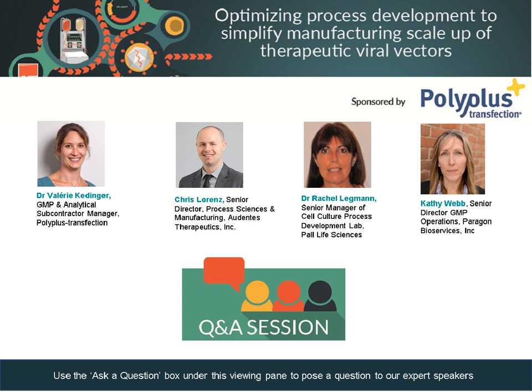So when you are scaling up the process, you have to take into consideration multiple factors for the current existing market situation with gene therapy and viral vector production. So as long as we are having adherent cells, for example, then you have to make sure that you are moving into automation to reduce significantly the manipulation, and that will reduce the lot-to-lot variation. You have to use the right transfection reagent that will be friendly, reproducible, and less toxic when you are enlarging the volume of your process.